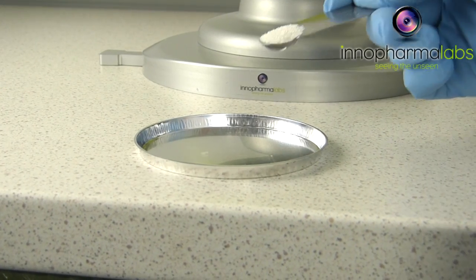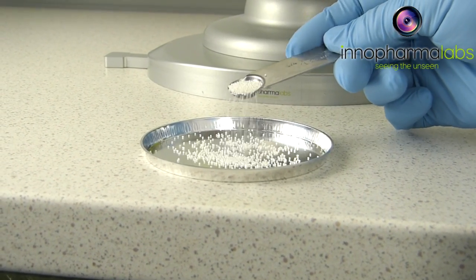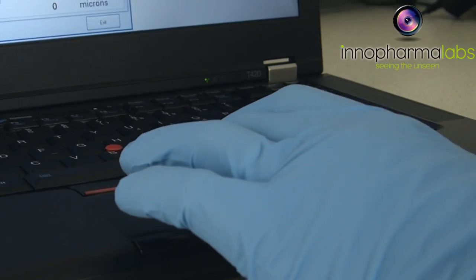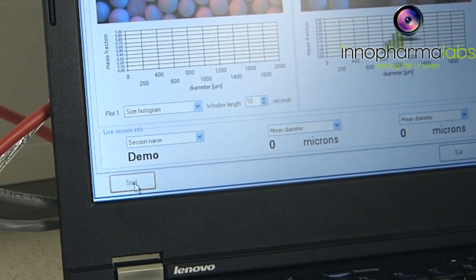To analyze a sample, it is first placed in a sample tray. This tray is then placed on the ICON stage. The sample information and analysis details are entered into the custom software and the run is started.